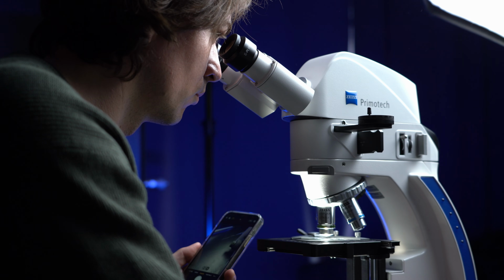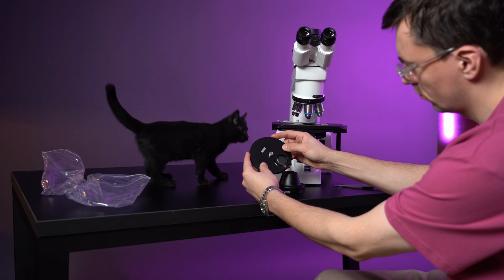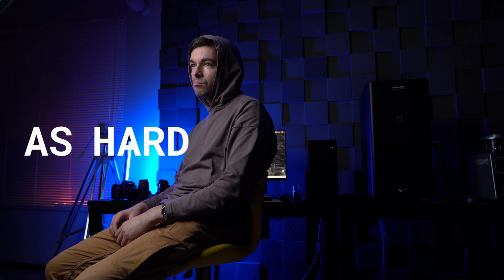You wake up one morning and suddenly realize, starting today, your new hobby is microscopy. You are ready to spend up to $1,000 on this new passion. You're just beginning your journey into the world of microscopes and you don't really know what to expect yet, but you want every single dollar to work as hard as possible. This video is for you.